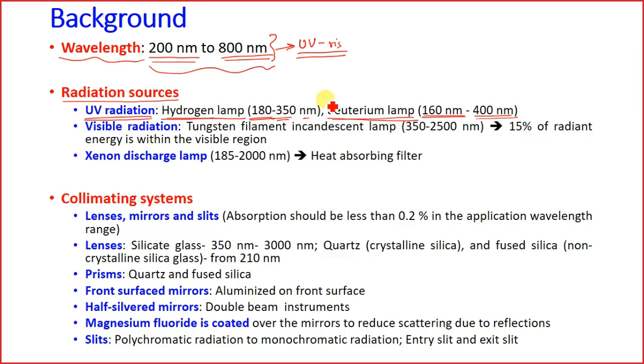Usually in current day commercial UV visible spectrophotometers, we have deuterium lamps.